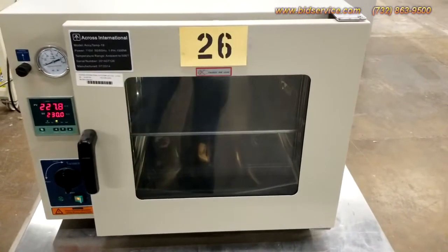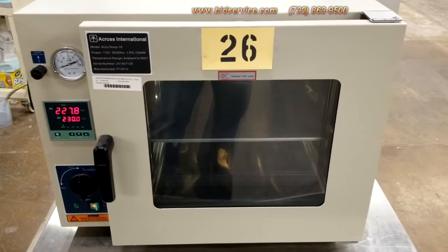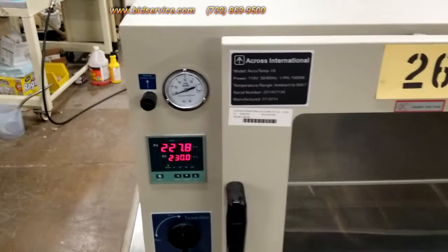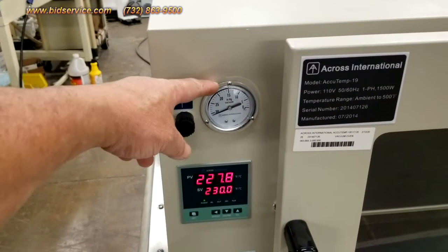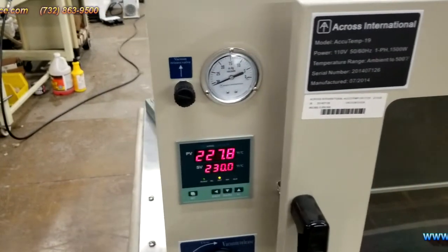This video demo is for the Across International AccuTemp 19. Right now, over here, I have vacuum admit in. Here's the vacuum gauge — it's already down below 30 HG.